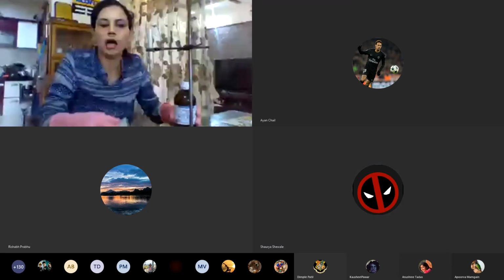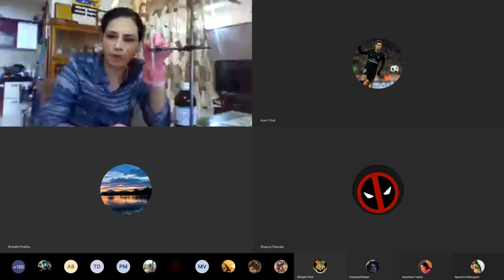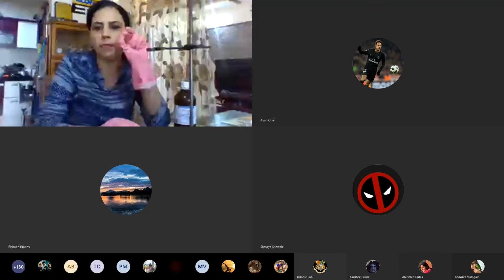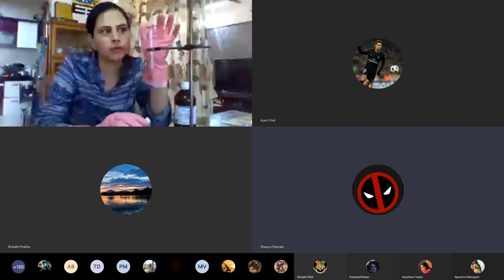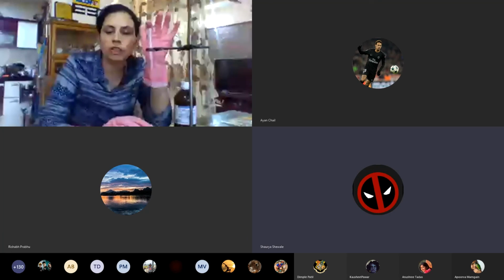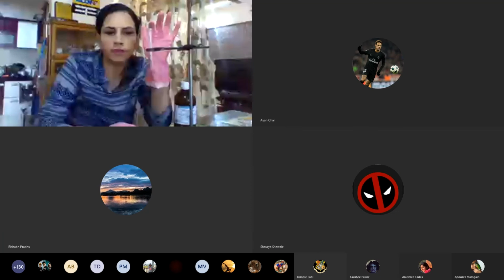So what else I'm going to do is, I'm going to put sulfuric acid in this, and then I'm going to add a small piece of sodium inside it. And then what will happen is, sodium will react violently.